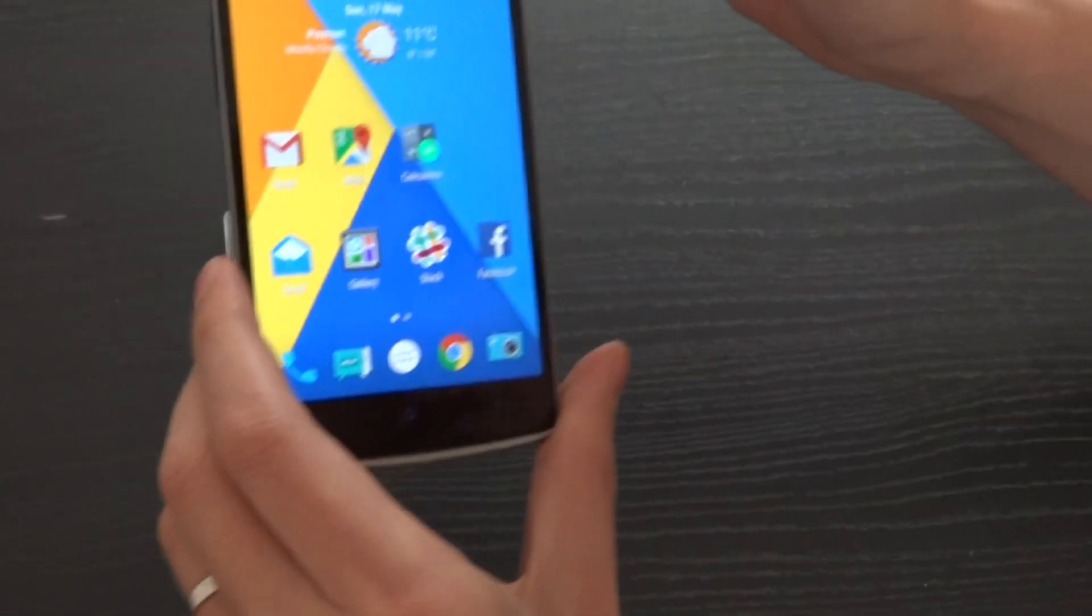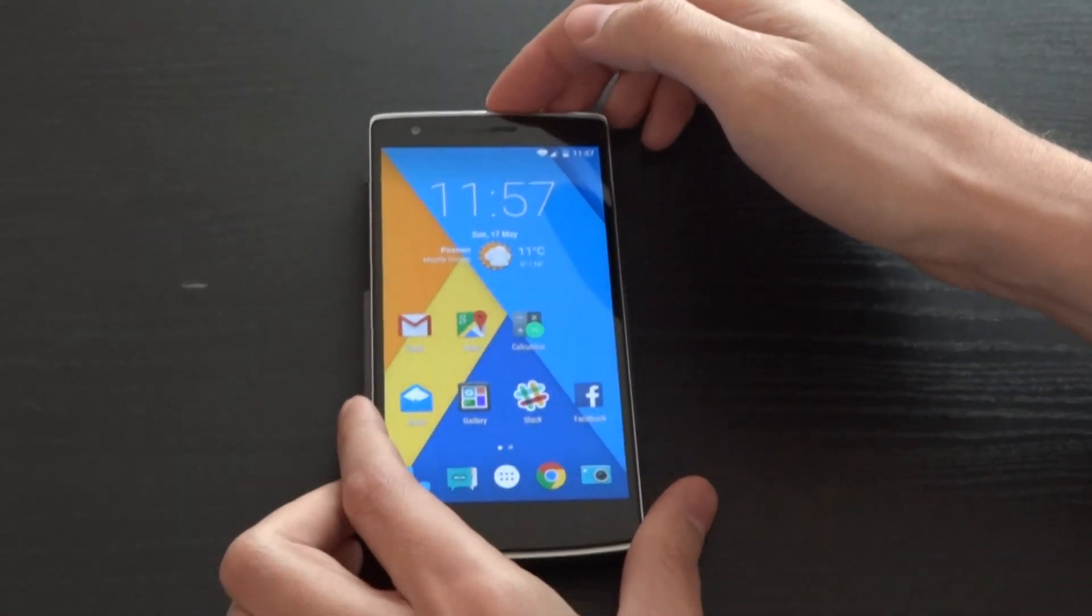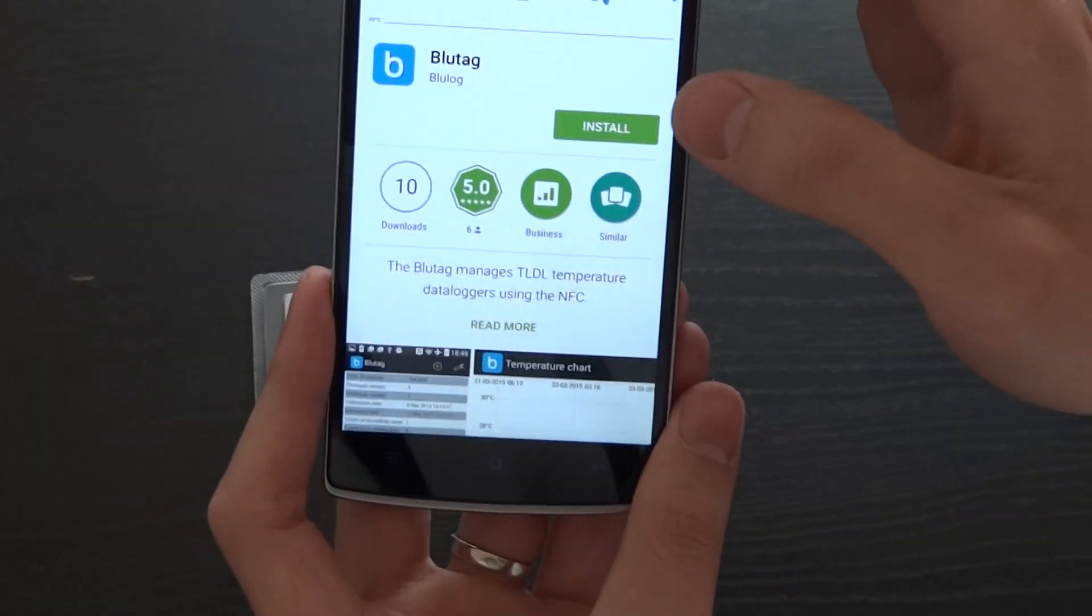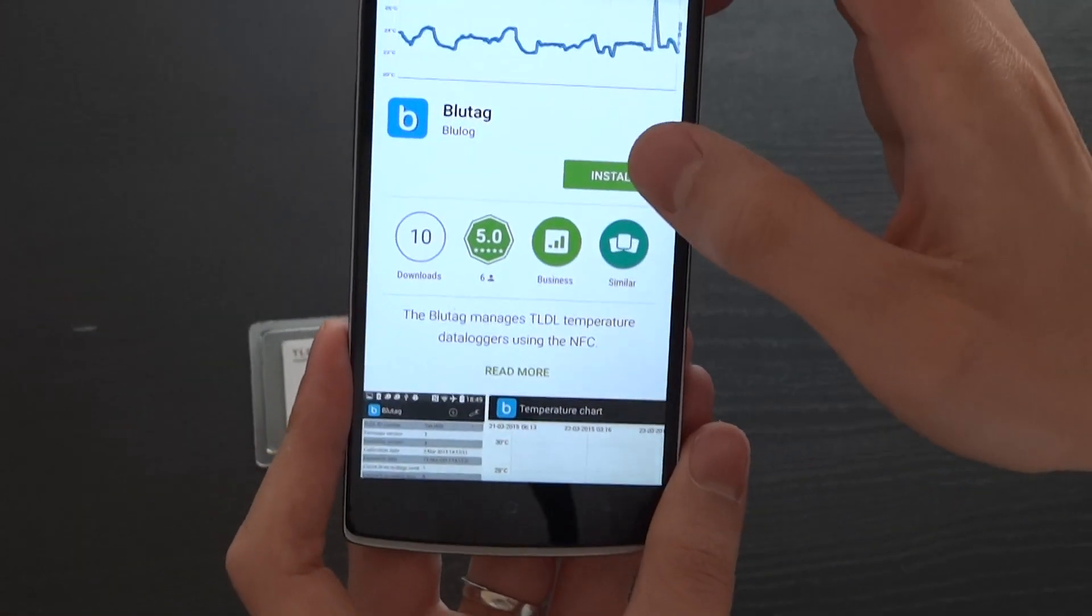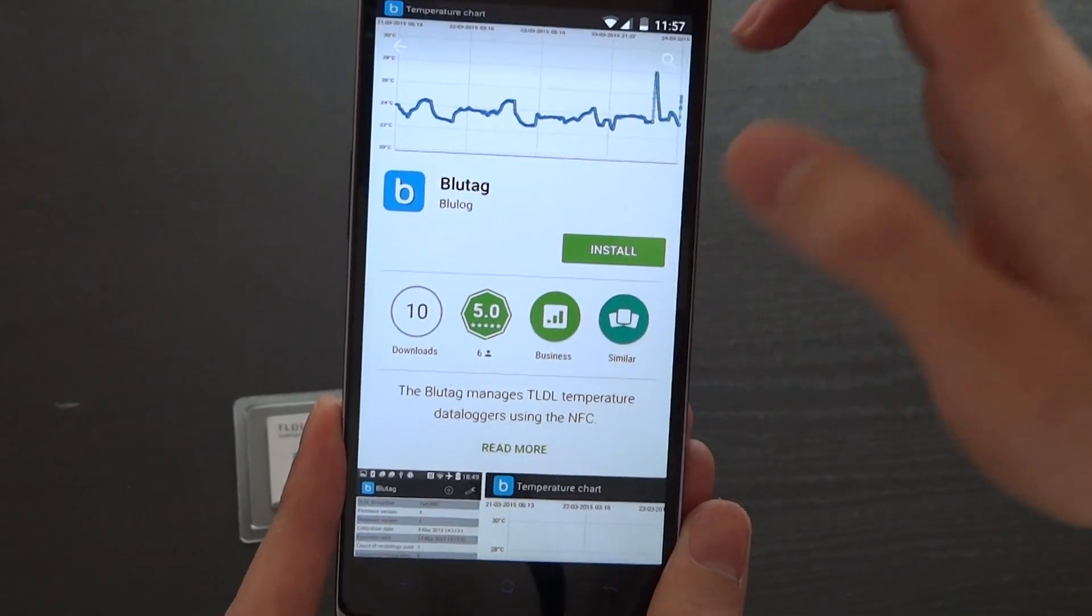Then simply place your smartphone next to the logger. You will be redirected to download an app on Google Play which is called Blutag.